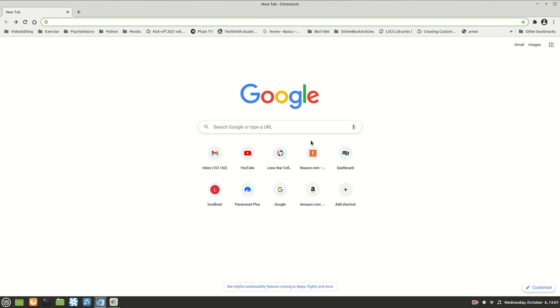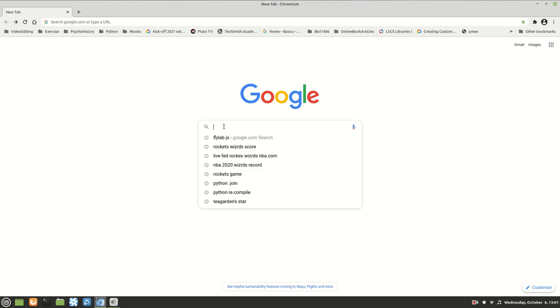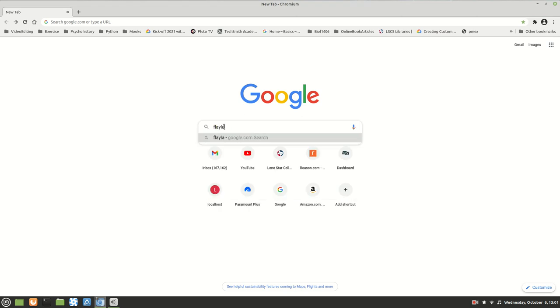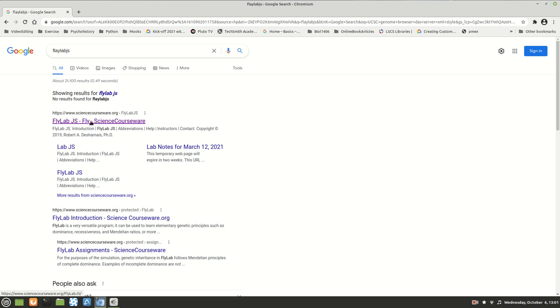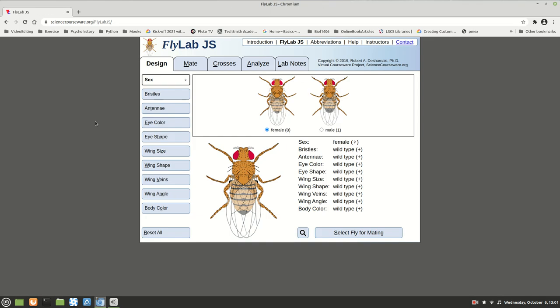This video is to learn how to use something called FlyLabJS. This is what we're going to use for our laboratory experiments in genetics. To find the website, go to Google and type in FlyLabJS. You'll get a result — just click on FlyLabJS FlyScienceCourseWare and you'll come up with this website.